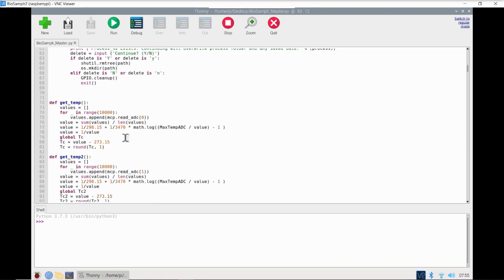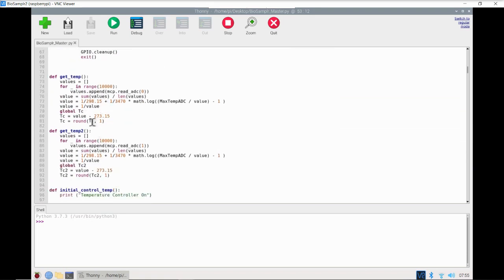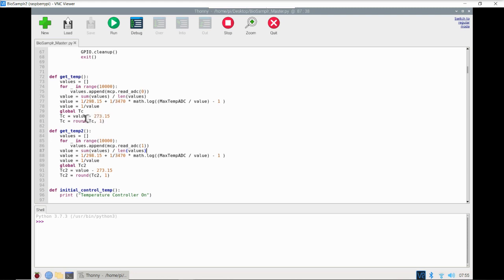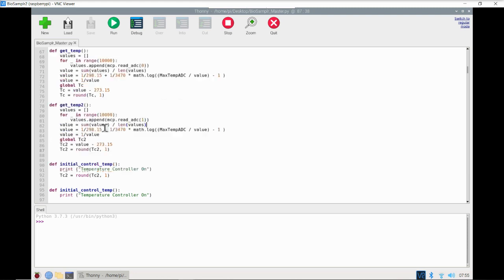Next we have two getTemperature functions. These are going to call a channel reading from that analog-to-digital converter chip, reading channel 0 or channel 1, which are the two channels of the thermal probes. It's going to take that raw reading, translate it into a temperature, and then return that temperature.